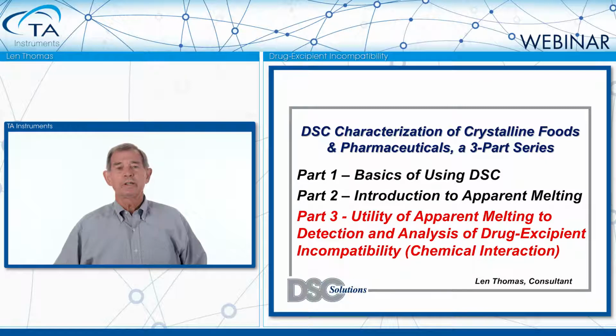In foods and pharmaceuticals. You'll find parts 1 and 2 in the TA Instruments webinar library. Part 1 dealt with the basics of using DSC to measure crystallinity. Part 2 was a relatively new topic for many that dealt with what is called apparent melting. As the name implies, it's an endothermic peak that looks just like a normal melting peak, but as we discussed in webinar 2, that endothermic peak is really the result of a chemical process taking place in the material. And that was a new subject for many.